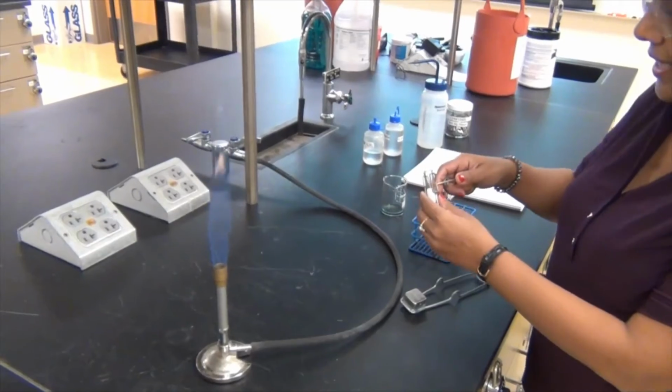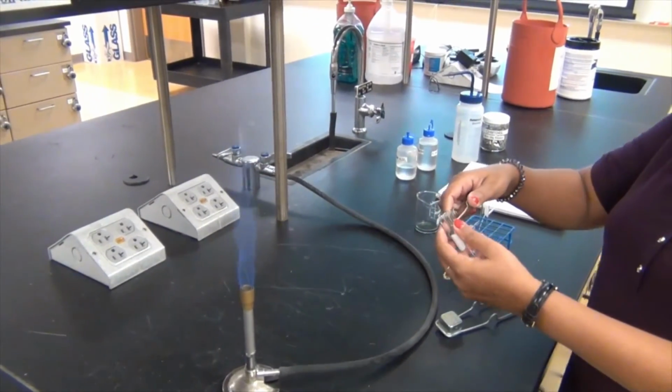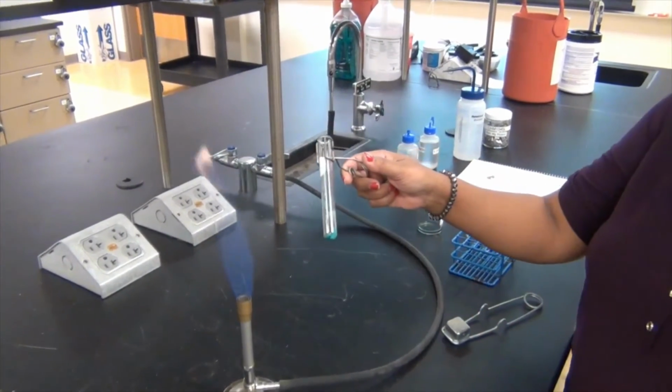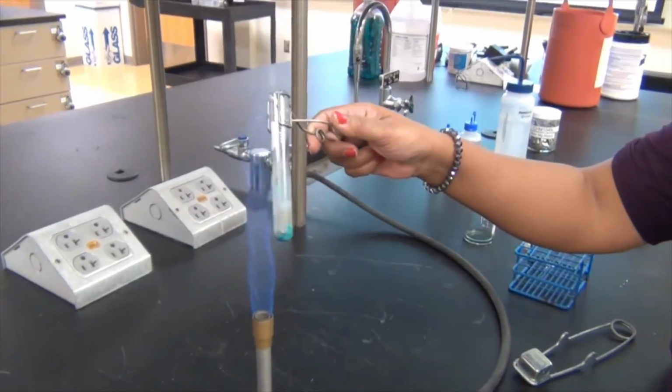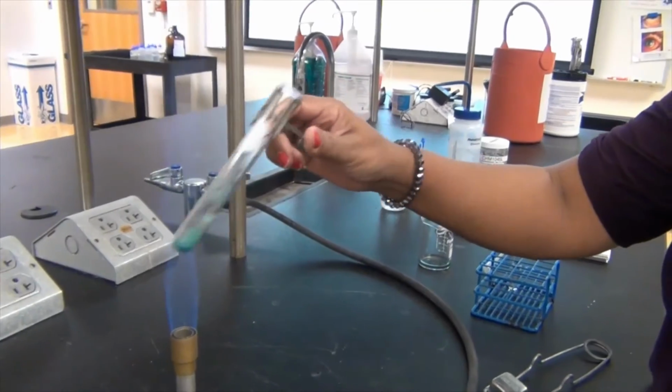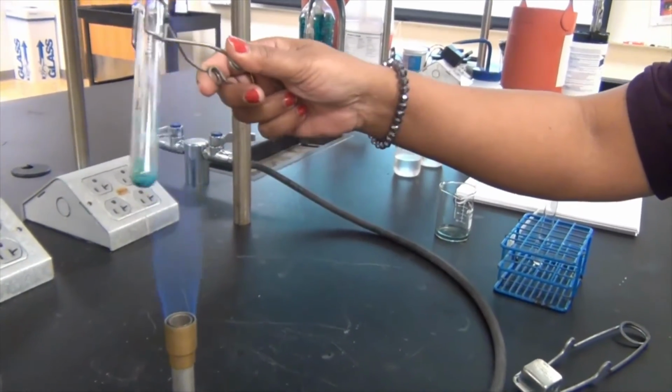This is always the exciting part, because the solid that's at the bottom here can actually jump out and whatnot, so I have to be careful. And I want you to watch carefully as to what's happening in here. And I'm not going to point it towards myself.